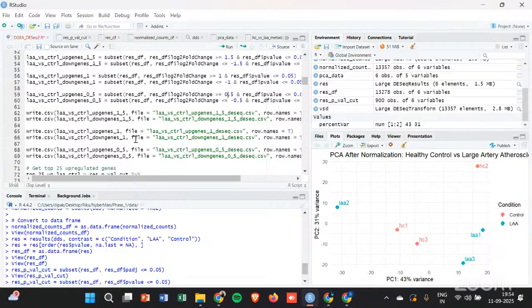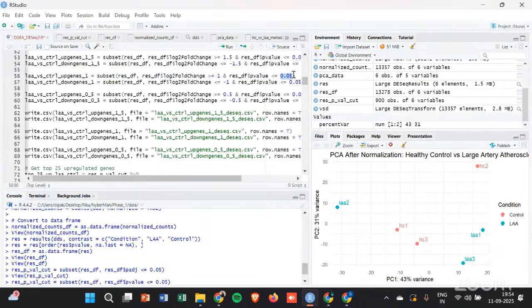That automatically means you will have higher p values. So in case of experimental conditions where it is a rare condition, you can ideally go up to a value of 0.1 as your p value. I have seen papers that have done that. But if you are taking a p value that is above 0.05, because 0.05 is the globally accepted value, it is like a sweet spot.